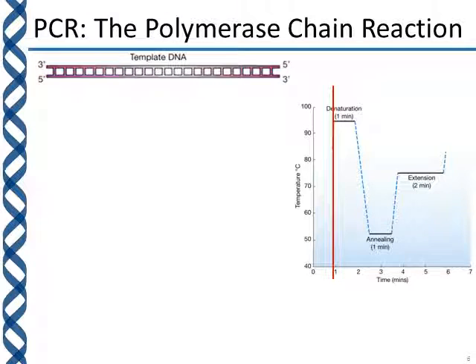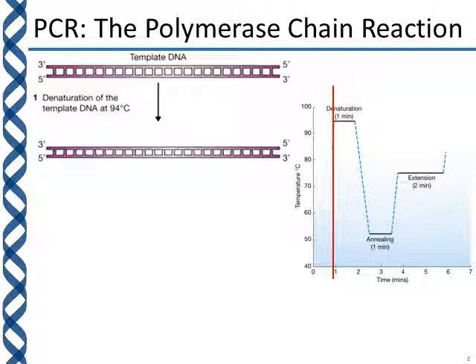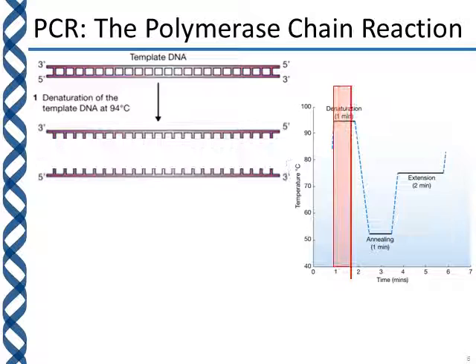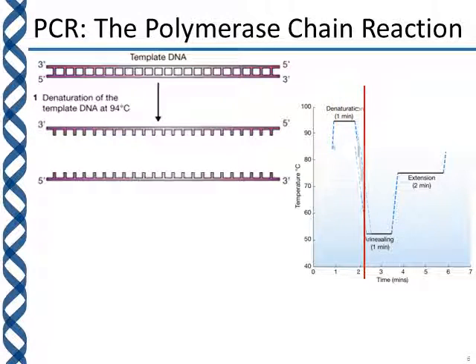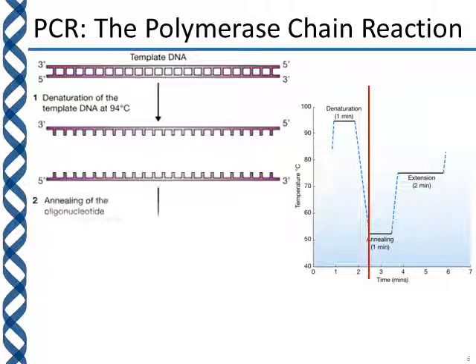So the very first step, we enter the denaturation stage. As I mentioned, that is where the template DNA strands will come apart. And so here in this generic program, we have approximately 95 degrees or 94 for 1 minute, and that application of temperature helps the DNA strands to separate.